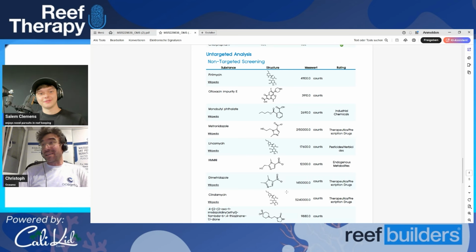Yeah, there was an Austrian reef tank, a really nice SPS tank. And Florian, hello if you're listening to this. We sampled his water for the Organo-MS, and there were next to no contaminants in the non-targeted. I think there were only 2 compounds we found, so very, very clean. But one of those compounds we found was saxitoxin. And I wasn't aware of saxitoxin before.